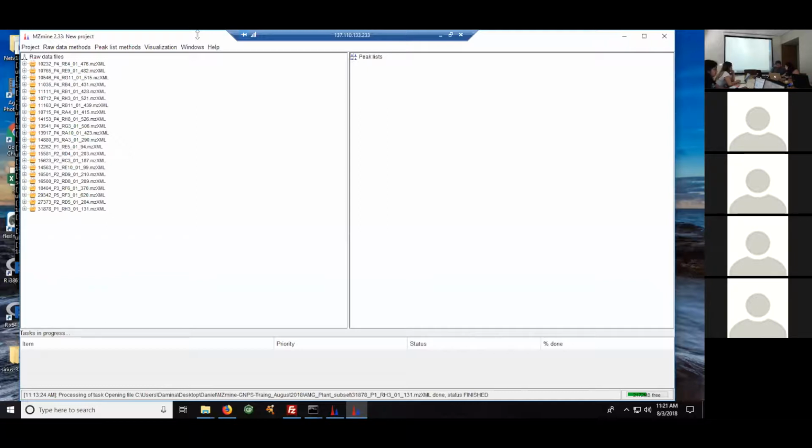You have to go in and click the mzXML files literally. All right, so I guess at least some of you managed to grab the data. There are some internet problems. If you cannot connect, then just work with your neighbor and later continue with the other files we provided.